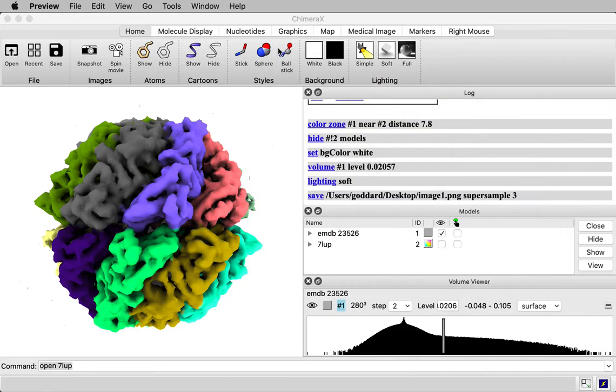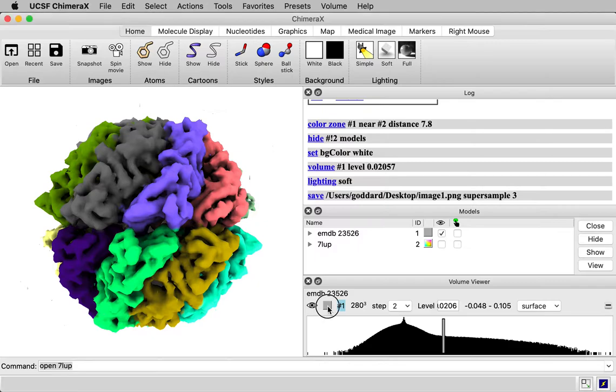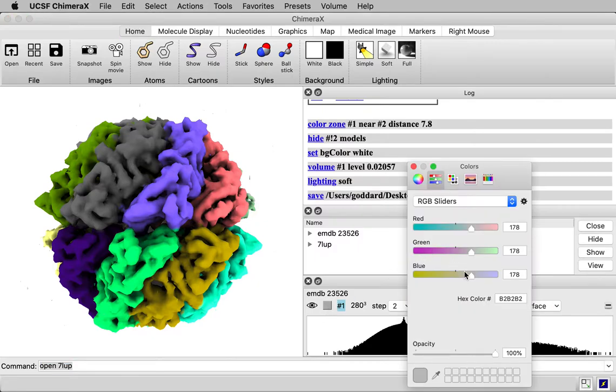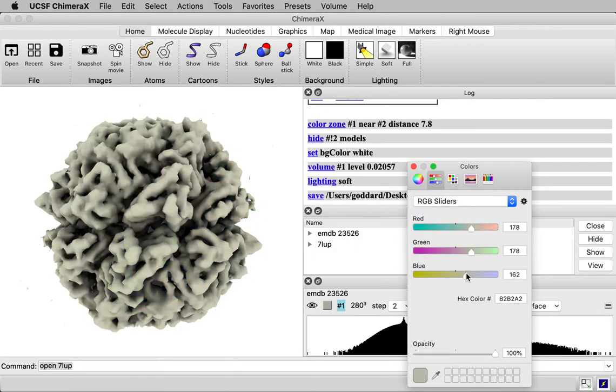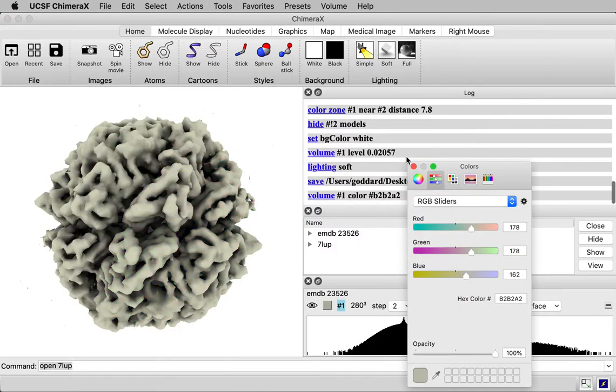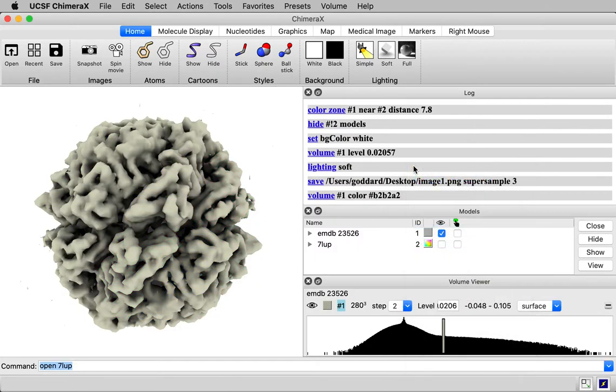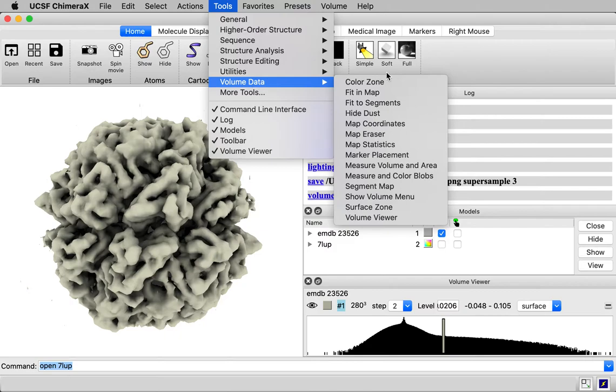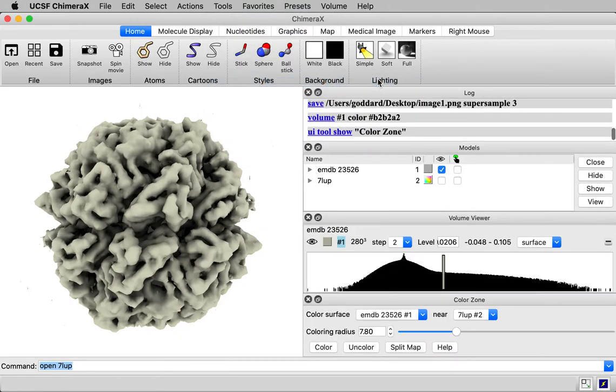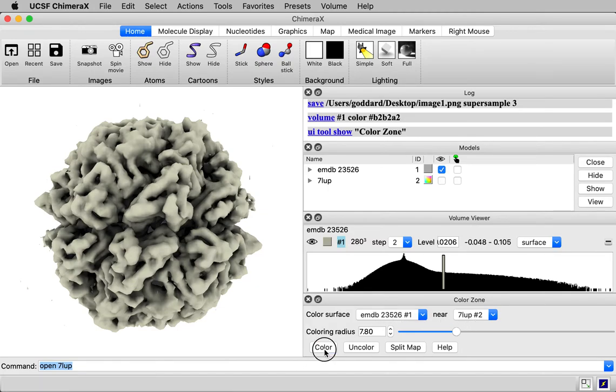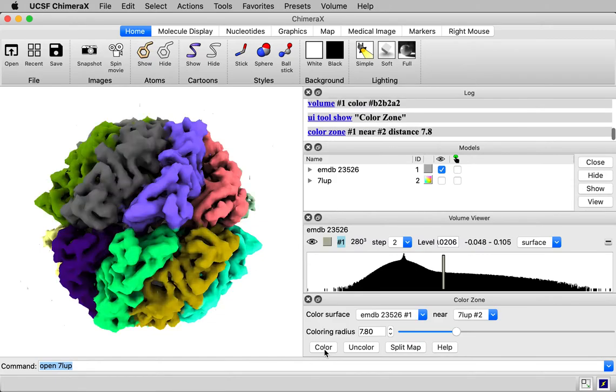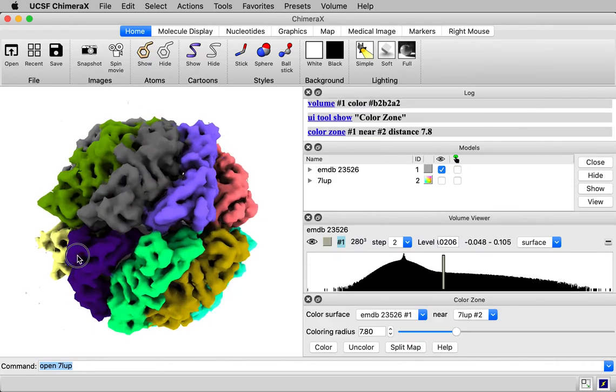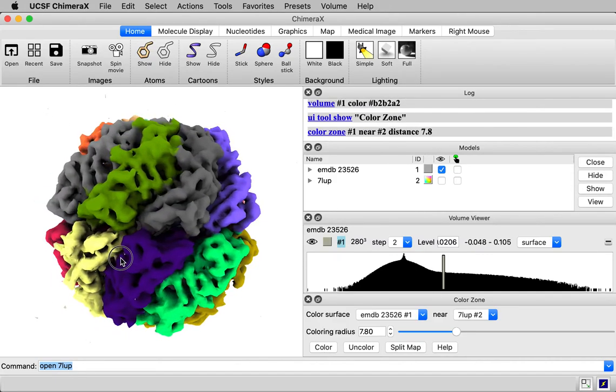Let me show you two other ways to do this coloring. So first let me change it back to a single color. And I'll show you how to do it with a graphical user interface panel. It's under tools, volume data, color zone. So the panel down here, it says color surface of this map, this EMDB map near 7 LUP. If I hit the color button, we get the same coloring we just had.